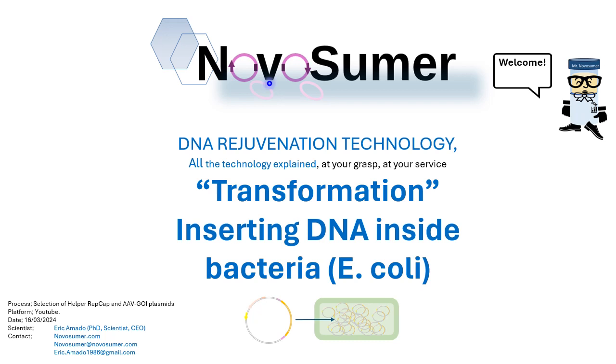Hello everyone. Here we are in another session, diving into the world of rejuvenating our DNA, the anti-aging technologies. This is the fourth video of the course, and today's topic is the transformation in plain words: introducing DNA inside bacteria. As you can see here, inserting DNA inside bacteria. Easy, right? Straightforward. And it is a very important step in the process.